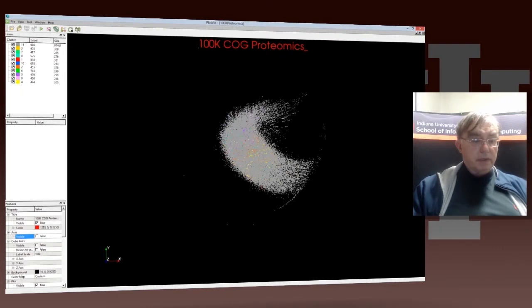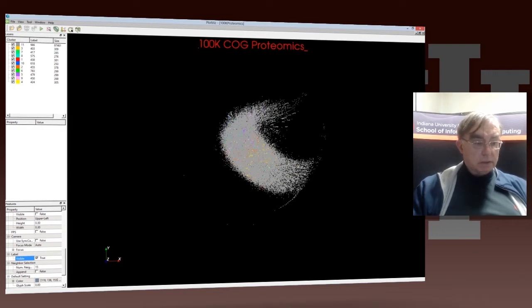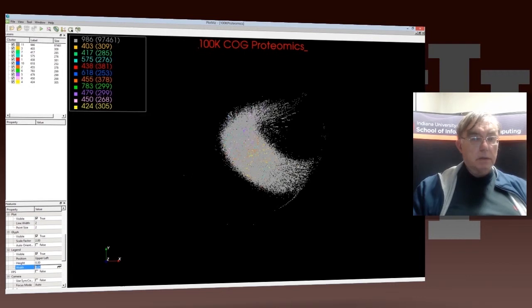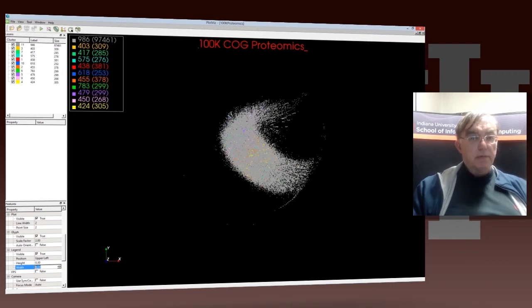Let's see what we've done here with the label command. So let's get the status of the clusters really clear. Doesn't seem to do anything wrong. Sorry, that's not what I want. That's the wrong thing. I want the legend, not the label. That's a mistake. Here's the legend. We'll set the legend to be true. And then we'll change this width.